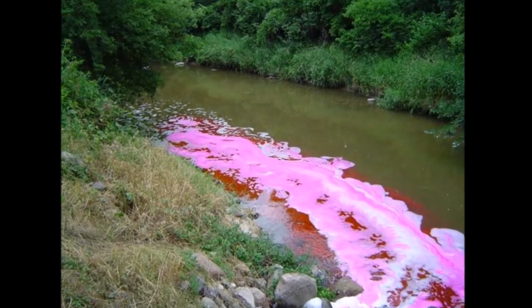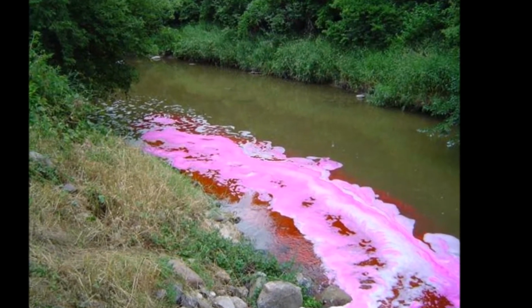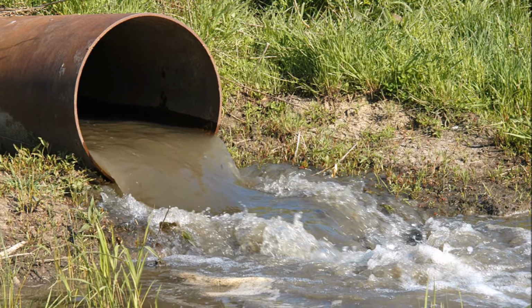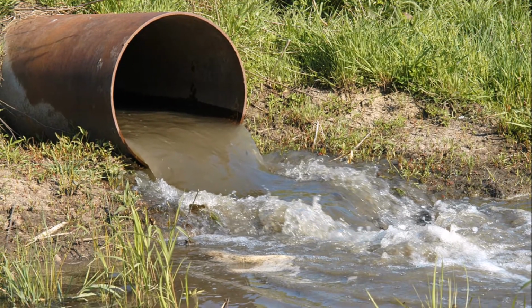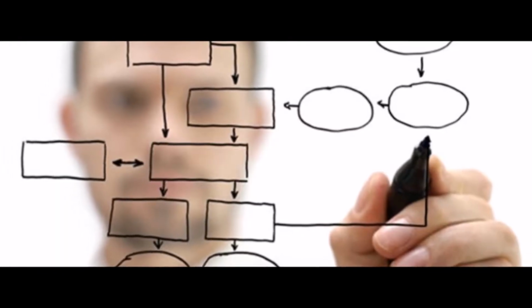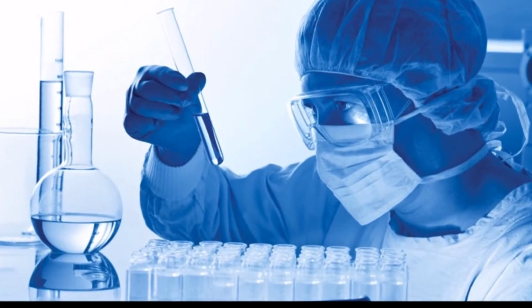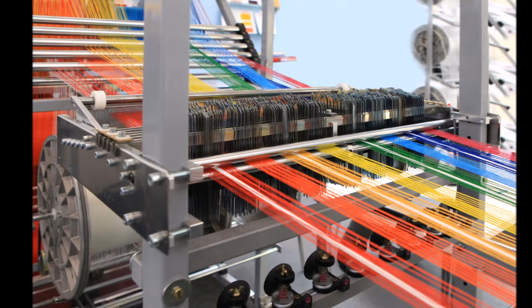There is an increasing concern towards the discharge of synthetic colouring agents from chemical industries due to its impact on the environment. Many of these agents are immiscible in water and cause major problems when they are discharged. Analytical methods have been proposed for the detection of these agents, but no concrete procedures have been established or cited in literature. The major purpose of this study was to design and optimize an accurate, sensitive, analytical method for the quantification of mutagenic dispersed dyes produced in textile and dye-making industrial processes.